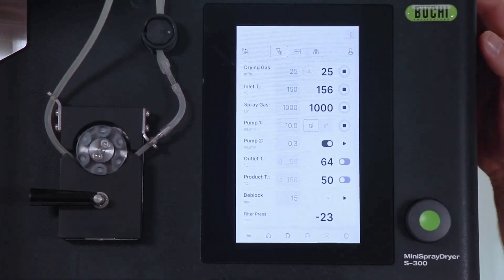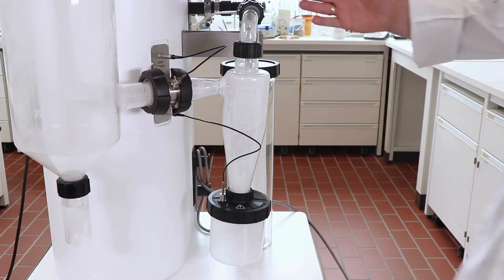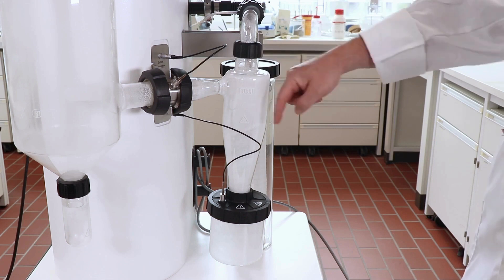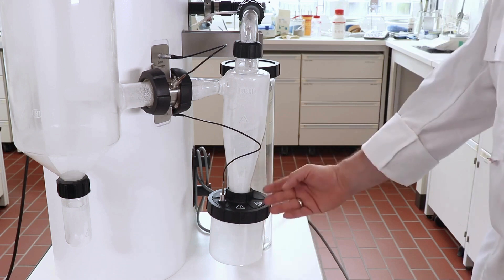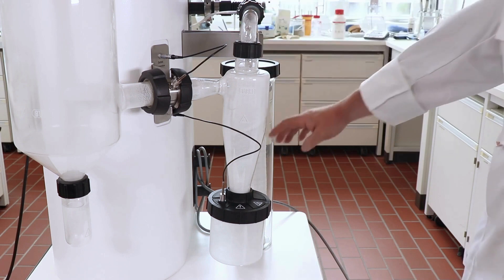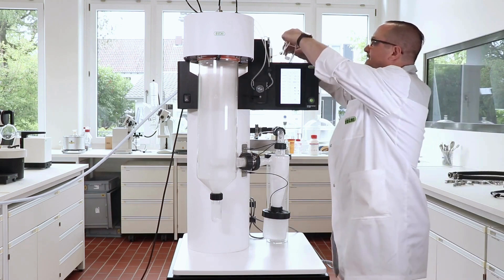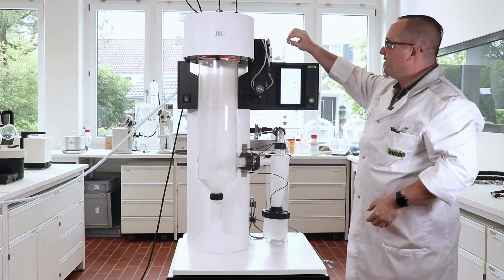While we are still producing, let's have a look at the cyclone and the product-receiving vessel. You can now see the collection area better. In the cyclone, the air turns vigorously and brings down our particles. Some of the fines are going into the angle tube and will probably enter the filter where we get rid of those particles. As you can see, our sample is almost finished — we are already sucking some air into the tubing.